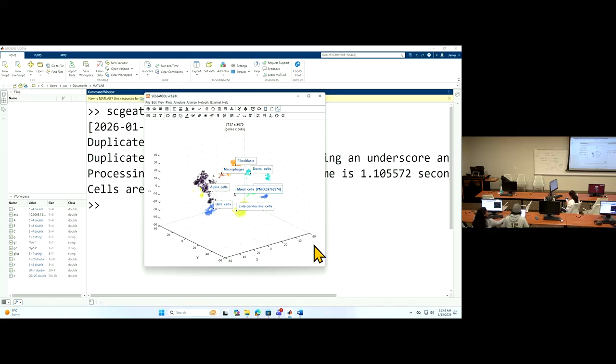So this interface is a working product. So you can use it to do real analysis and to generate publishable results. I have a lot of collaborators using this. They extract the screenshot and they can publish in the journals. No problem.